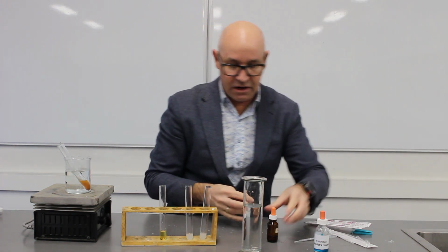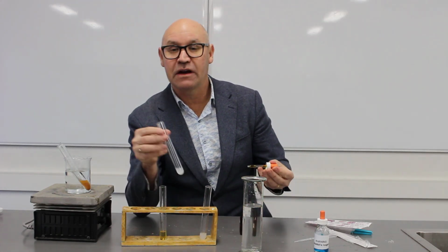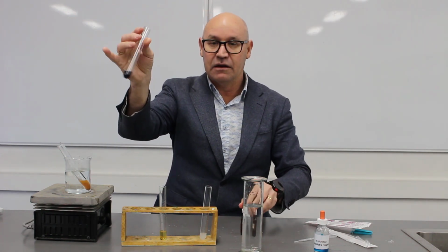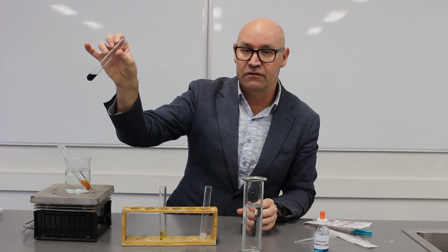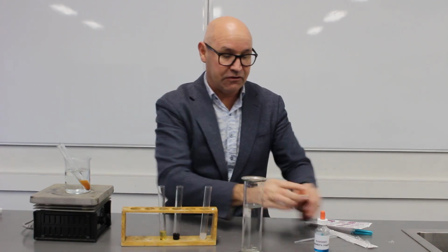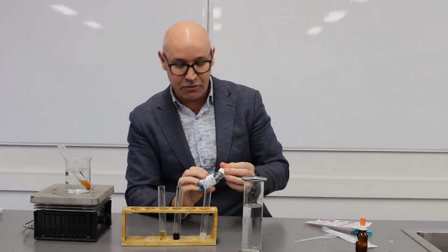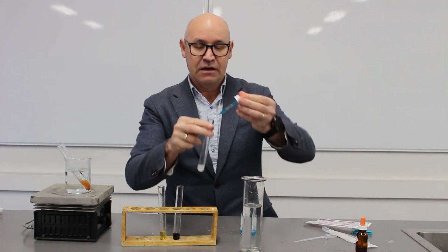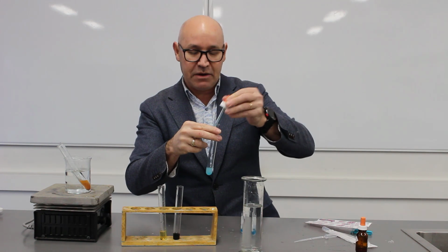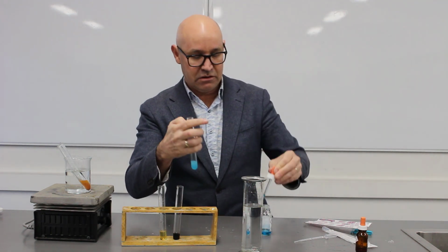Okay, right. Let's do our starch test. Remember, a positive for starch is the blue-black colour. And there you go, immediate. Okay, so that's a positive test for the starch. So it confirms that there's still starch in that. In other words, not all of the starch has been broken up into glucoses yet. And our very last test is we'll repeat our Benedict's test on our liquid that's inside our tube.